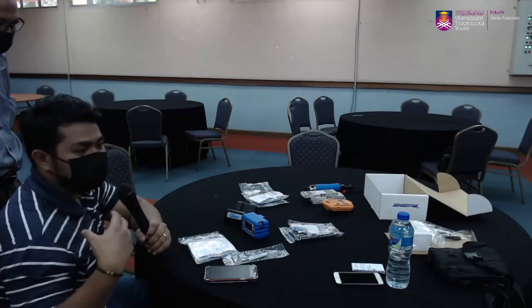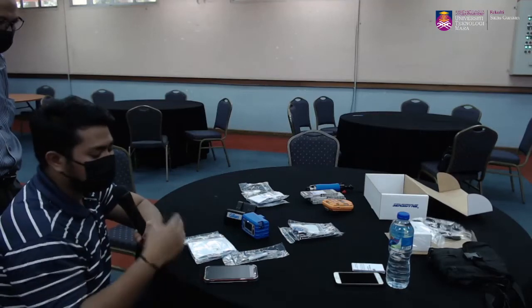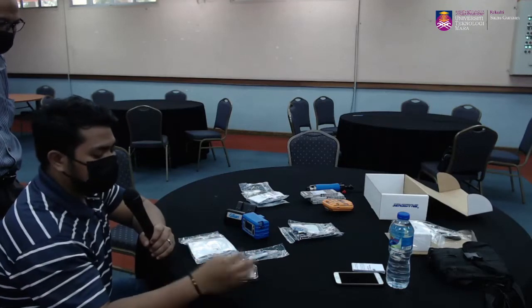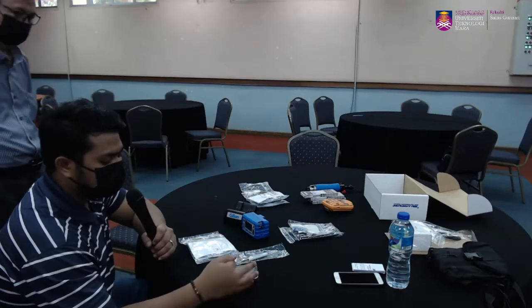Sebab in terms of the user, dia tak tahu apa nak kena buat. Dia tekan benda tu stop. So kita tak dapat the proper sample. So daripada kita punya pump ni, dia akan mentionkan, dia akan try dapatkan kita punya flow rate yang kita dah set earlier on sampai dia boleh.